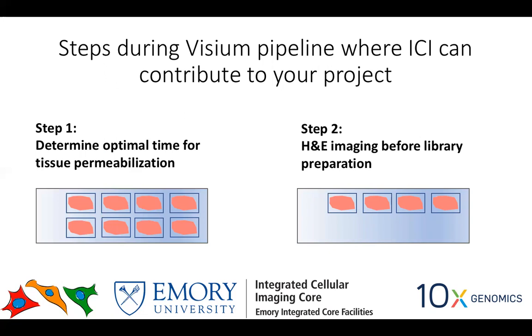So the reason for doing H&E over here at step 2 is to make sure that the tissue integrity is okay and you have a proper tissue on your slide, as well as overlay the final readout of your mRNA copies onto a particular cell per se. I mean, I wouldn't say a particular cell because the region that you are spatially looking at is about 50 microns in size. So you don't get a cell, but kind of a 50 micron region per se.